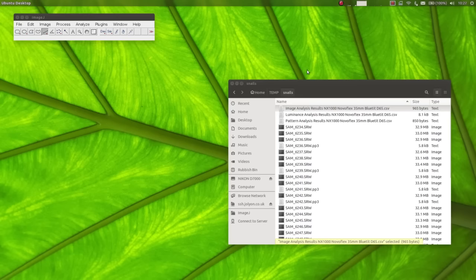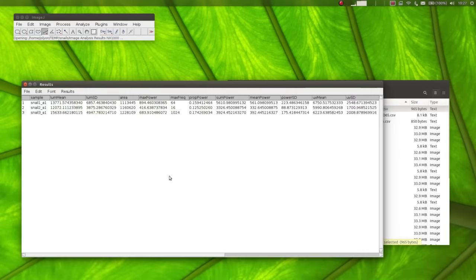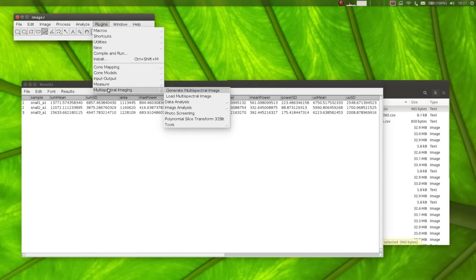Following the batch analysis, we can also run a simple color difference measurement. So in order to do that, load up the overall data. From the batch analysis, it measured the ultraviolet mean, the shortwave mean, the medium and longwave means. So that's what we need for this blue tit example. Next, run multispectral imaging, data analysis, color JND difference calculator. This calculates the Vorobyev-Osorio just noticeable difference calculation to work out how similar two colors are and whether they are above or below the just noticeable difference threshold.